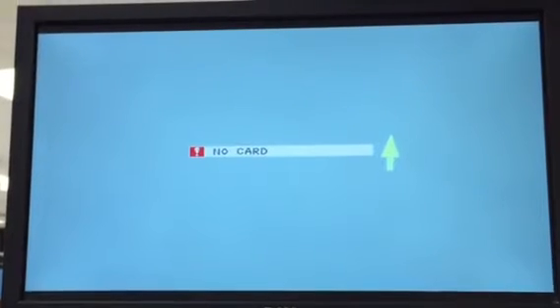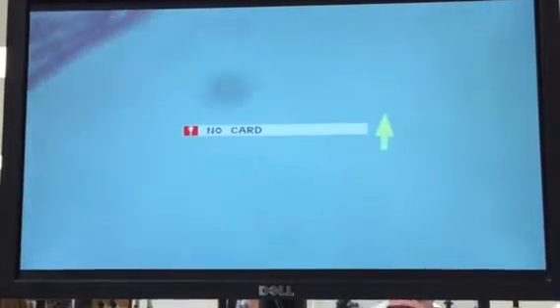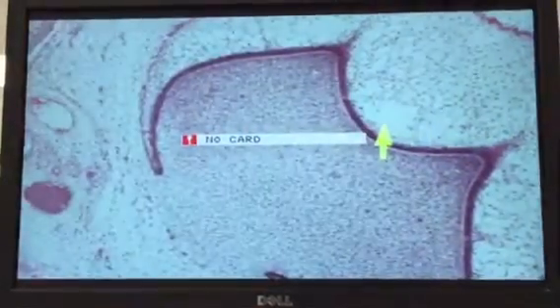9, 10, and then also a slide of rat incisor that you can look at. So let's take a look at some of those now. And bear in mind, look at more than one slide example of each one and see if we can find the different stages of the ameloblast life cycle. And also while you're at it, you can review the structures of the enamel organ.